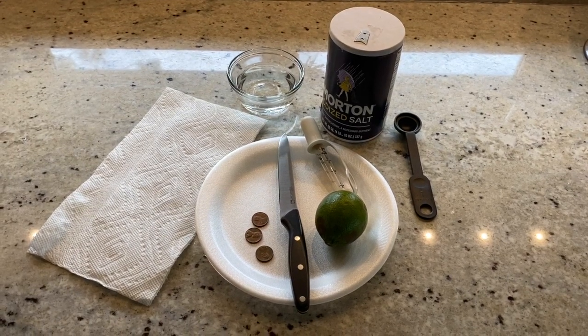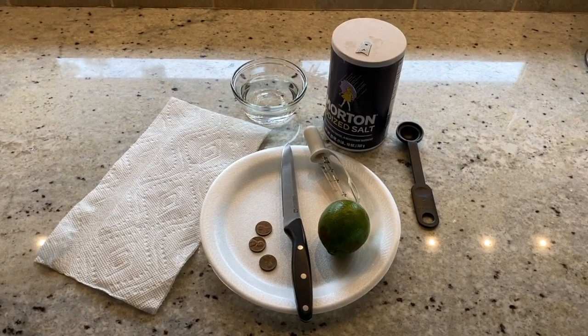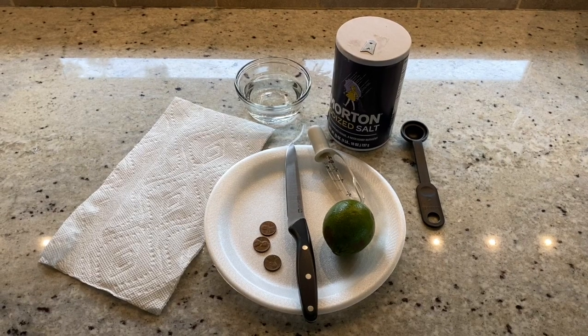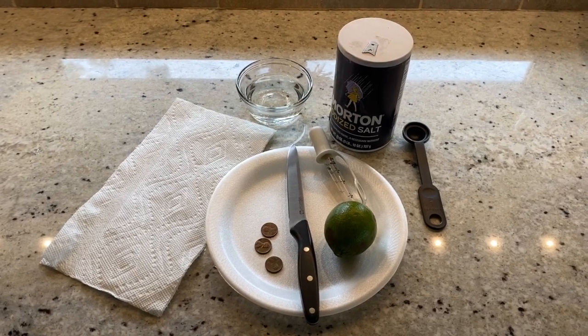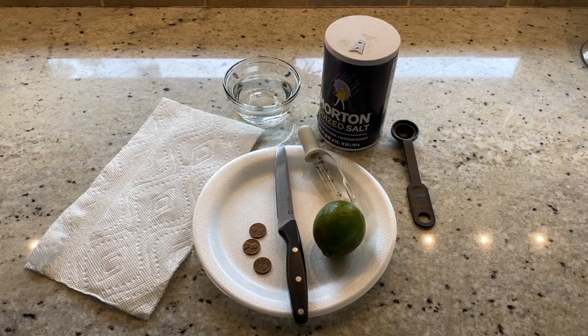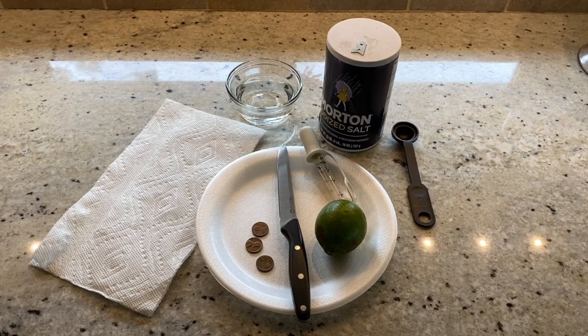Hello everyone. This is Teresa with Homeschool Primer. We are completing an experiment for Apologia General Science. This is experiment 1.2, chemical reaction, and we're going to determine what happens when you mix specific substances together.